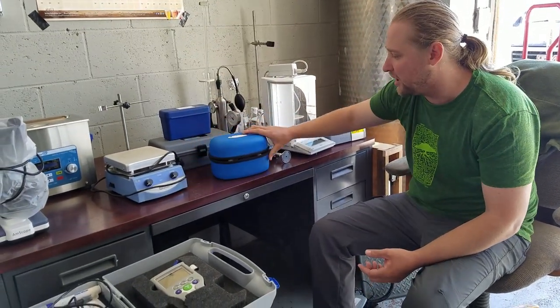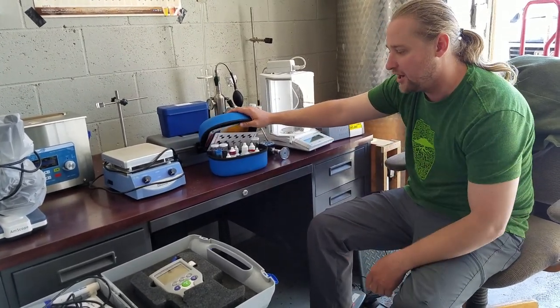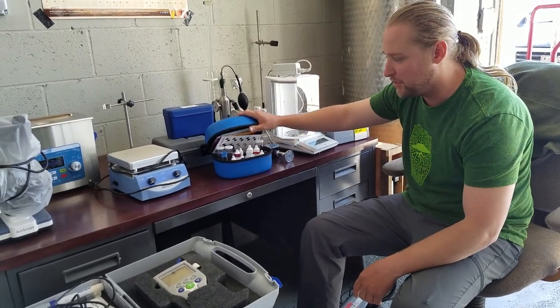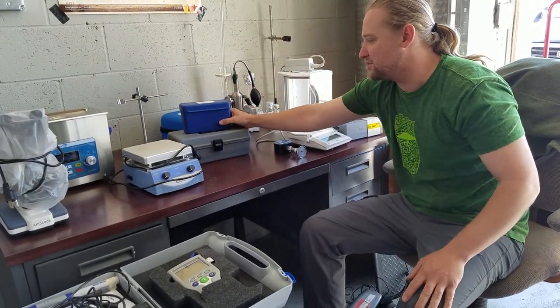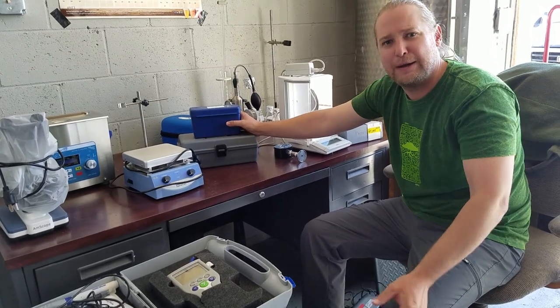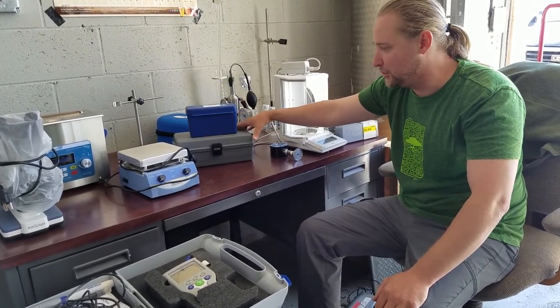Moving on down we have a simple water test kit so you can keep an eye on your water and make sure nothing changes from your city supply. These two boxes are chemical test kits — you use these to test the concentrations of your chemicals that you're putting in for your CIP loops.